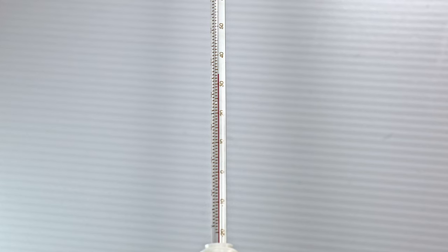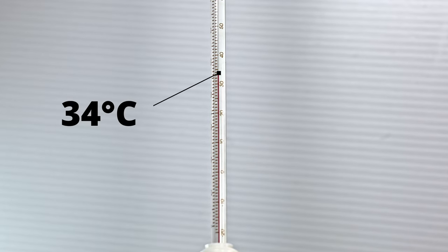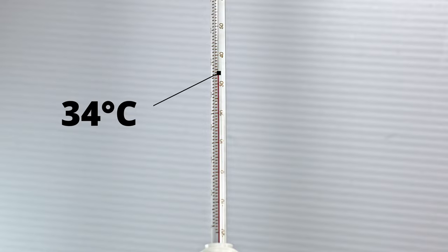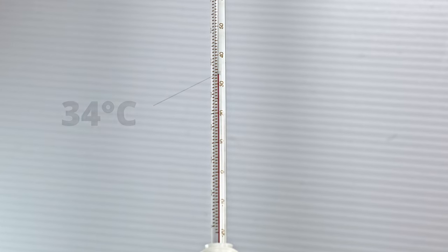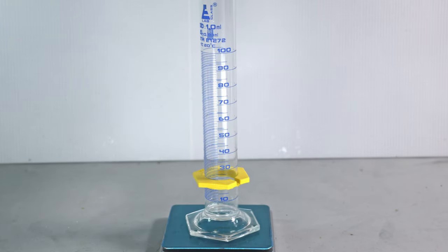Also you can see that our distillate is boiling at 34 degrees. This indicates we're boiling pure isopropyl chloride. Now we're going to weigh out our distillate.